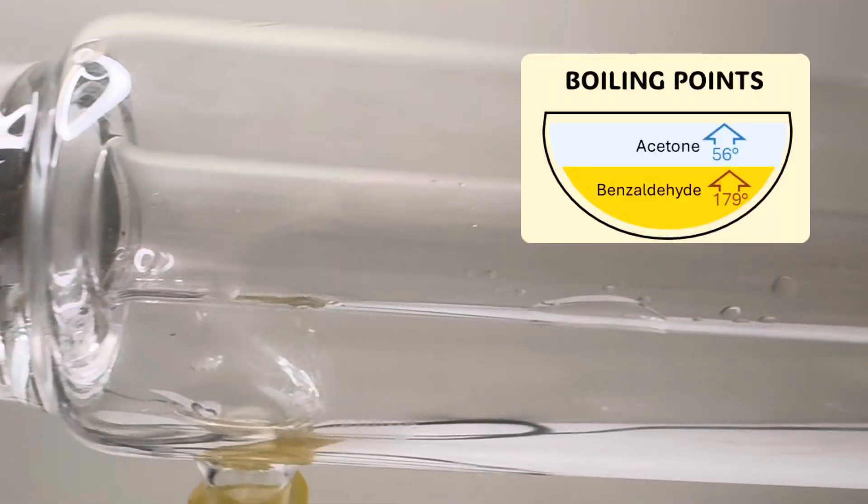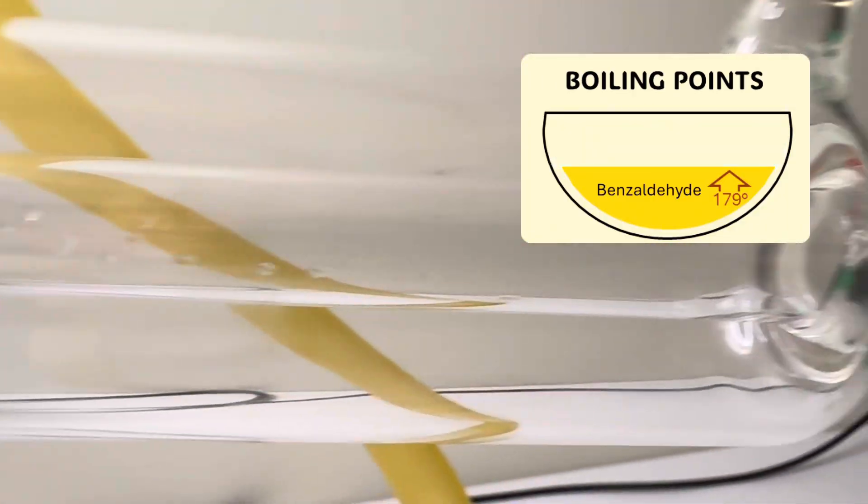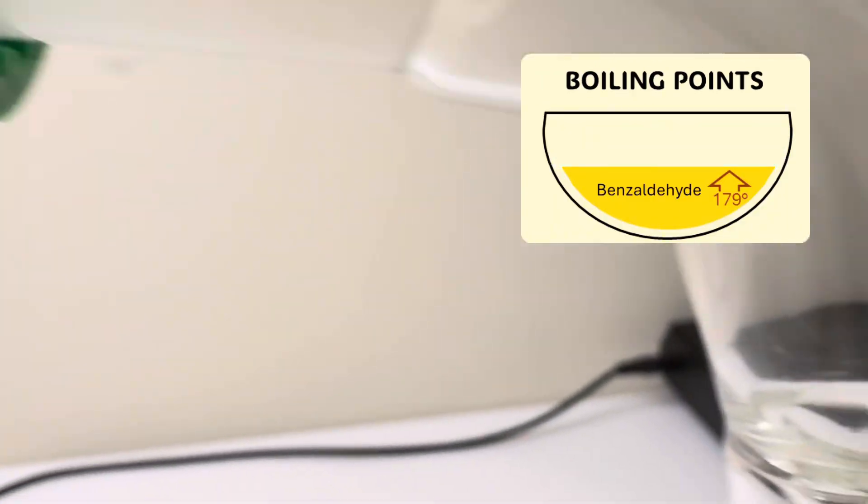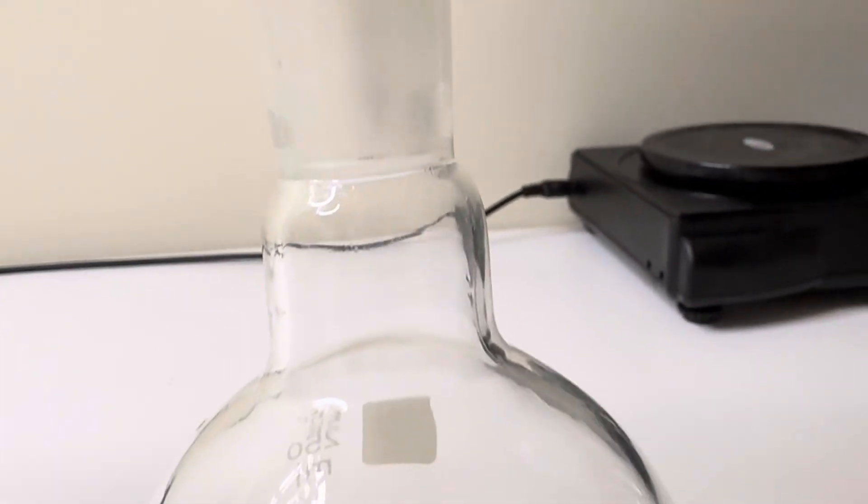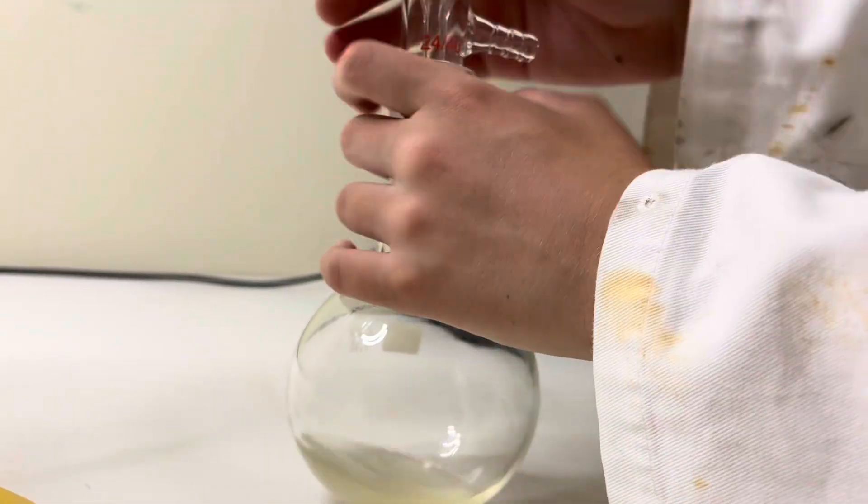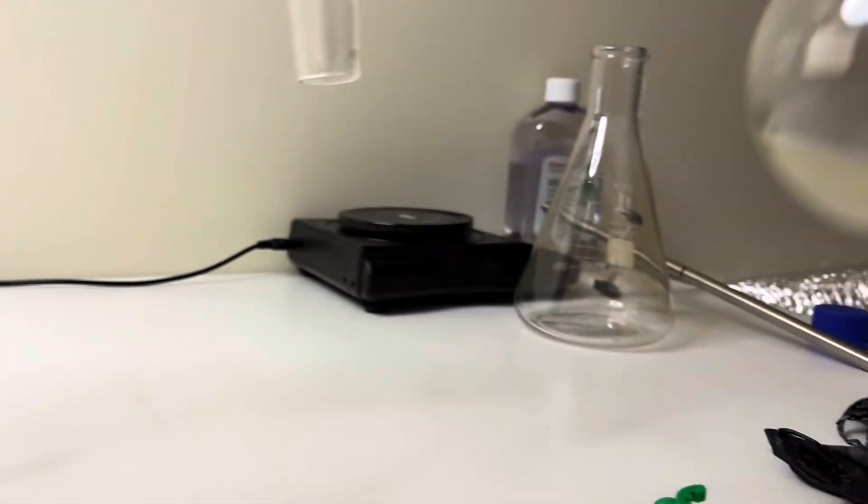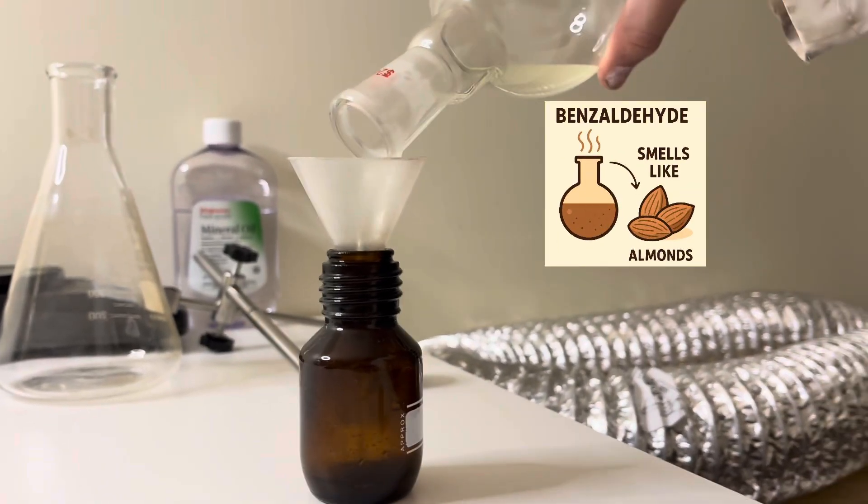So first the acetone boils off. And once the thermometer reads about 180 degrees Celsius, I collect the condensed liquid in the receiver flask giving me purified benzaldehyde. It smells like sweet and bitter almonds.